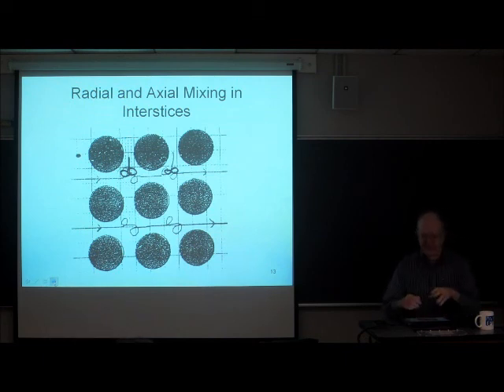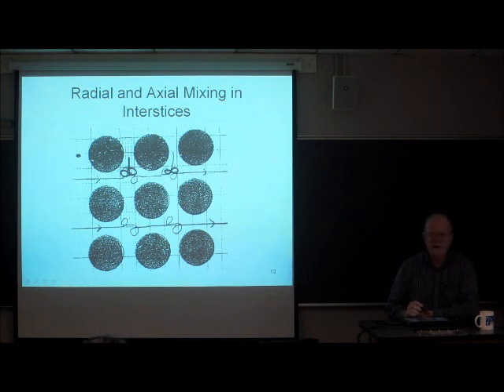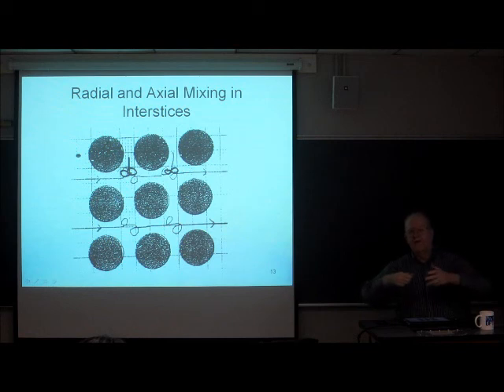Another way to think of it, this is the more regular array of particles, but between each couple of particles there's a little tiny mixing chamber. You think of little propellers in there causing stuff to mix up. And the longer a molecule spends in the mixing chamber, the wider the peak is going to get.